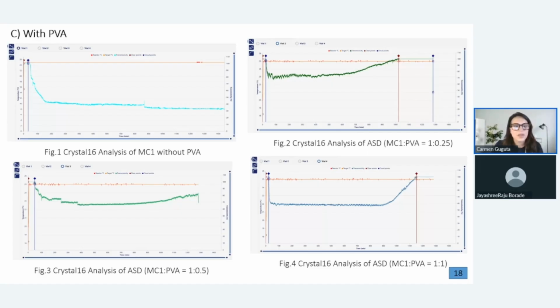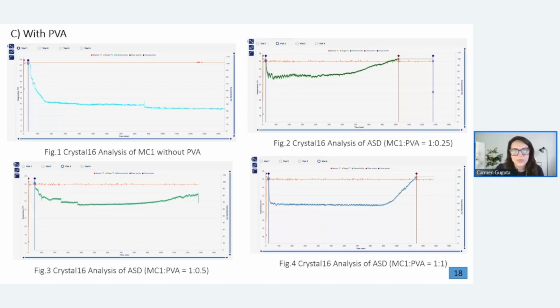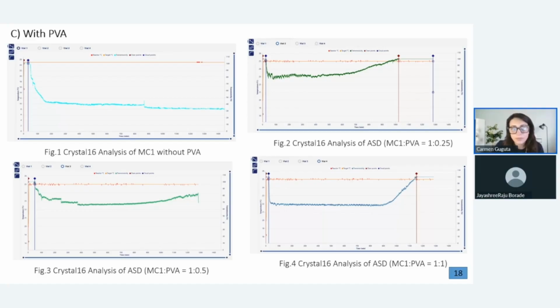Okay. One more. We have a few, so hold on with me. In what kind of APIs does crystallization inhibition help? Is it in drug product, such as type 4? I guess class 4 is what they are trying to say. What type of APIs have you used for this, where you were successful in inhibiting crystallization?